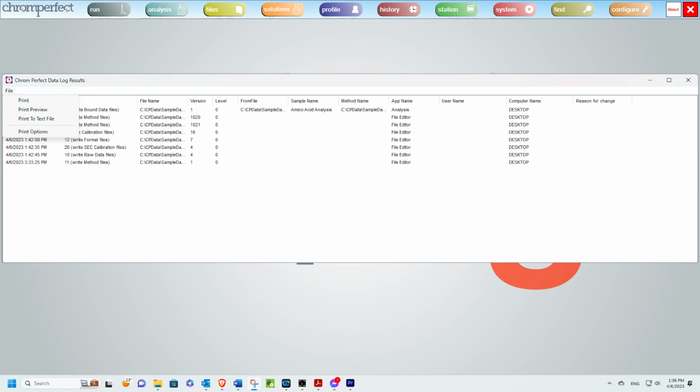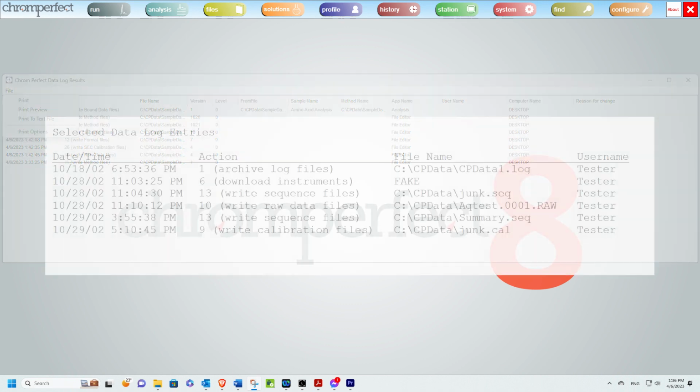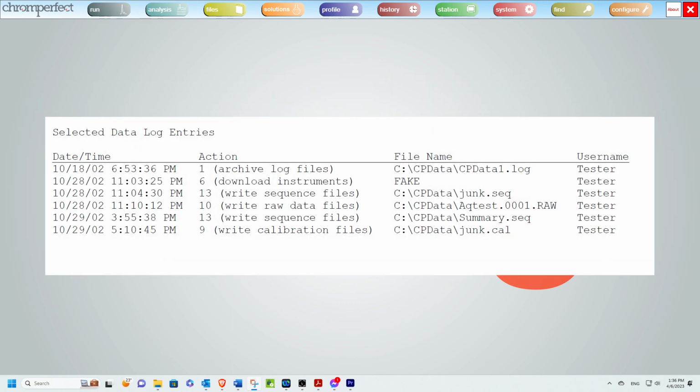If all the columns are printed, then the text will flow off the right side of the page unless the font is small. Choosing the Print Options item allows the user to select the columns of interest and suppress the rest. It is also possible to reduce the width of printed columns by stripping the paths from all file names. These settings do not affect the display form itself, but only the printout. A typical printout appears below.